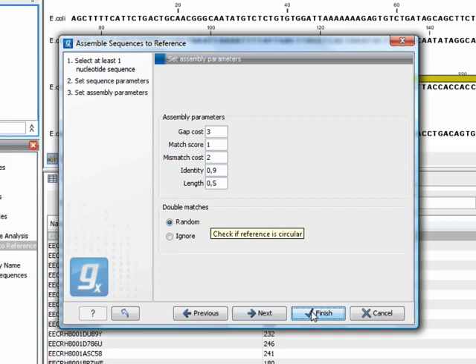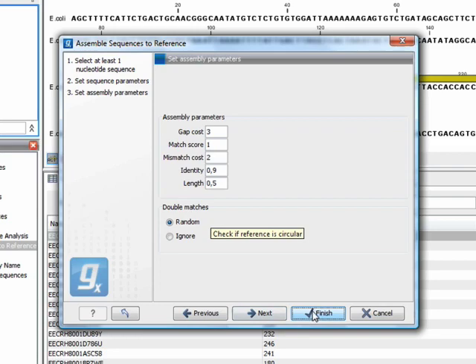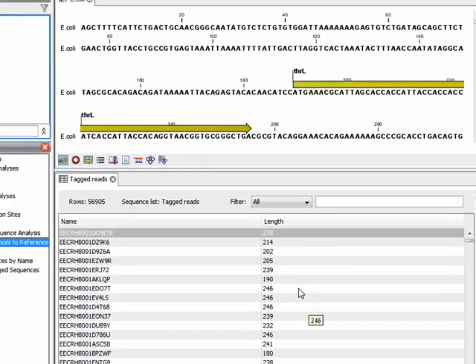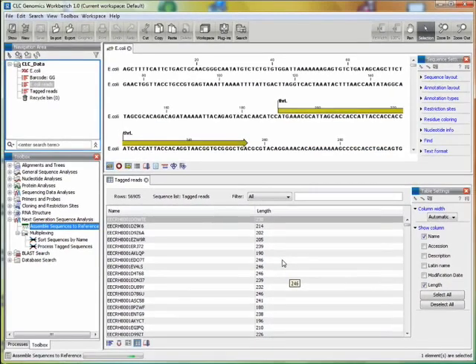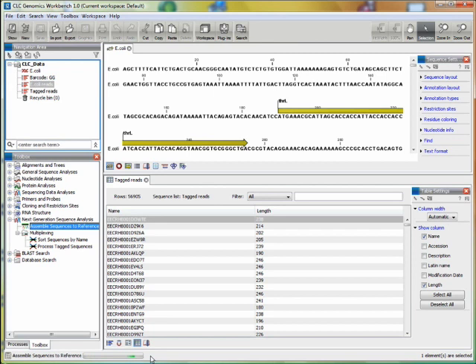I'll just apply some default parameters to the assembly algorithm, which is now running. What happens now is that the reads are aligned against the reference and sorted by alignment start position.